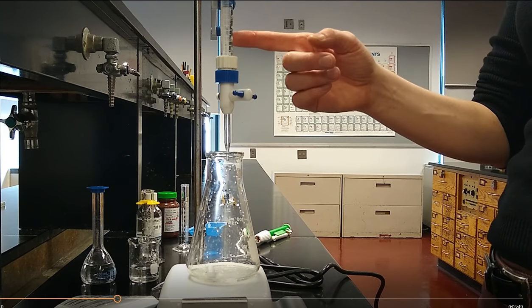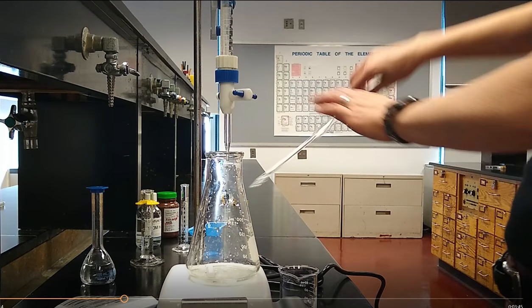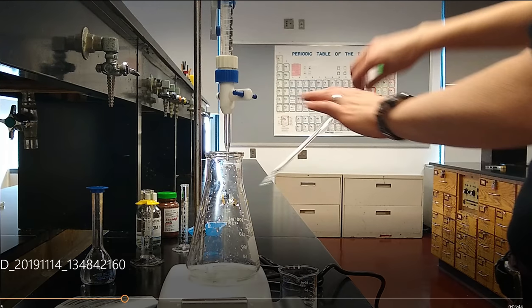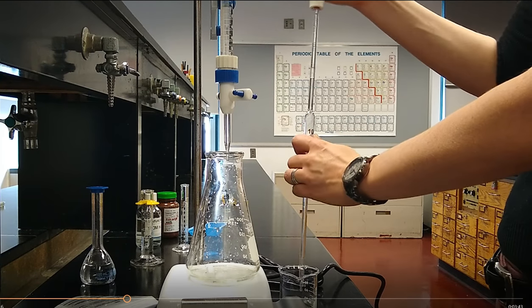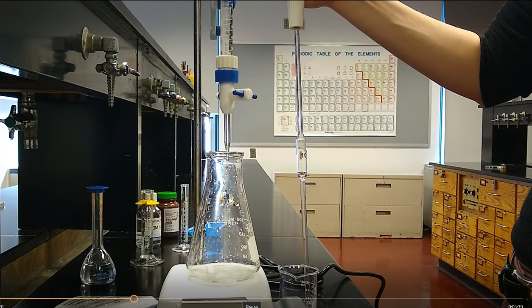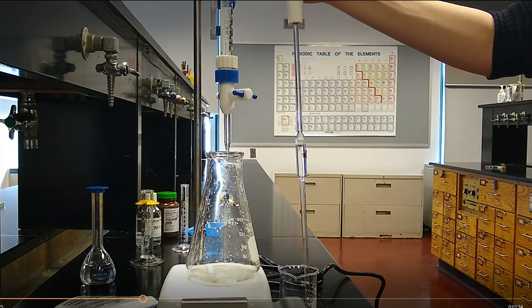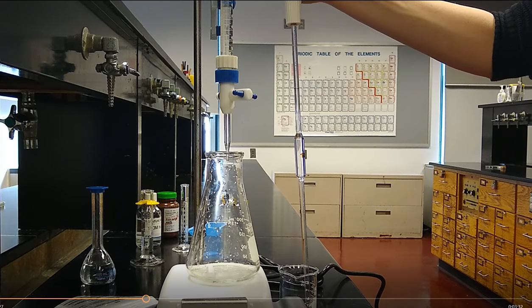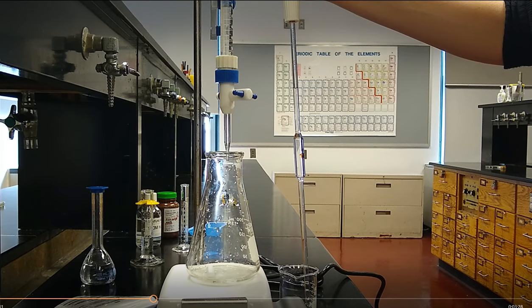The titrant sodium thiosulfate does get measured carefully. That's exactly why we're using the burette. So that does need to be measured extremely carefully. We also have our KIO3 solution. You need to measure out 10 milliliters of that. So of course the best tool for the job is the volumetric pipette. Make sure that you've rinsed the pipette with water twice to wash it, and then with your solution once to make sure the inside walls are completely coated with the solution. This has already been prepped so we're going to go ahead and use it.